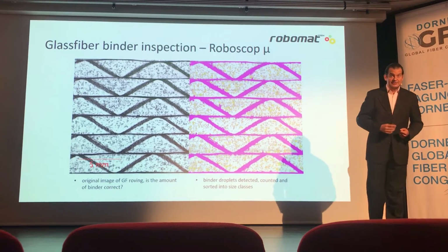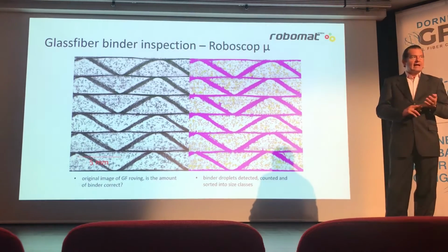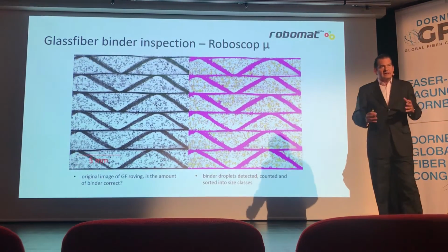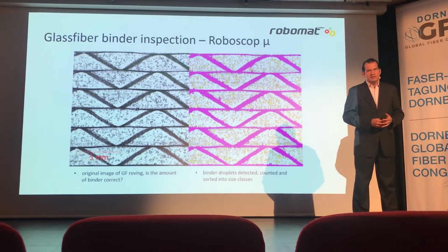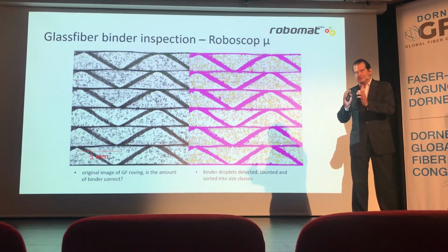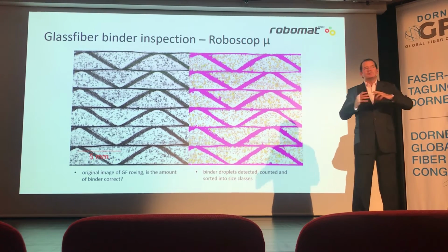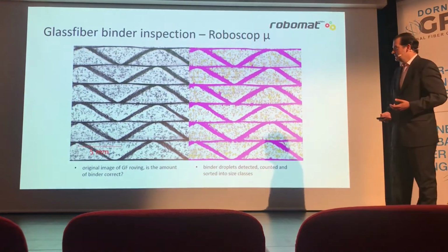Extremely interesting and extremely complicated products to look at would be glass fibers and carbon fibers, which we also have looked at. This is, for example, prepregs for the automotive industry, where it's very important that the resin inside is not too much molten, but also keeps the whole structure together before you go into further production.